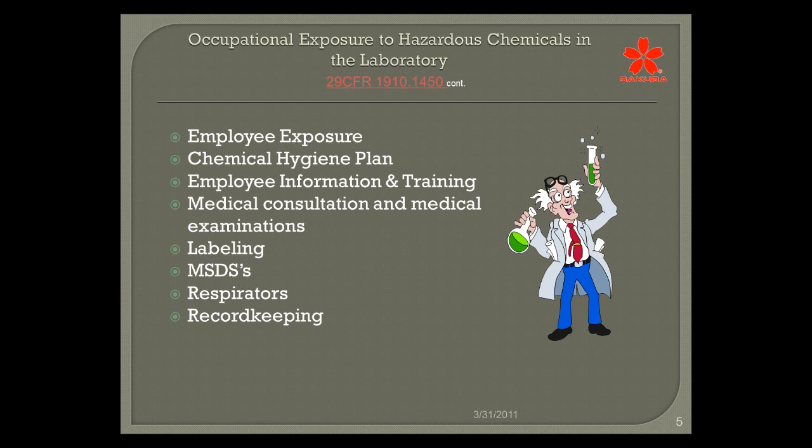You have to have the proper use of personal protective equipment and engineering controls. Personal protective equipment everybody kind of knows, but engineering controls, that's a chemical fume hood, a grossing hood, a sharps container. Those are considered engineering controls. They're pieces of equipment or other things that control hazards at the source. It also has to include some employee training, so it's based on the hazards in your lab. Like I said, it's performance-based, so you need to understand exactly what hazards are associated with your laboratory.